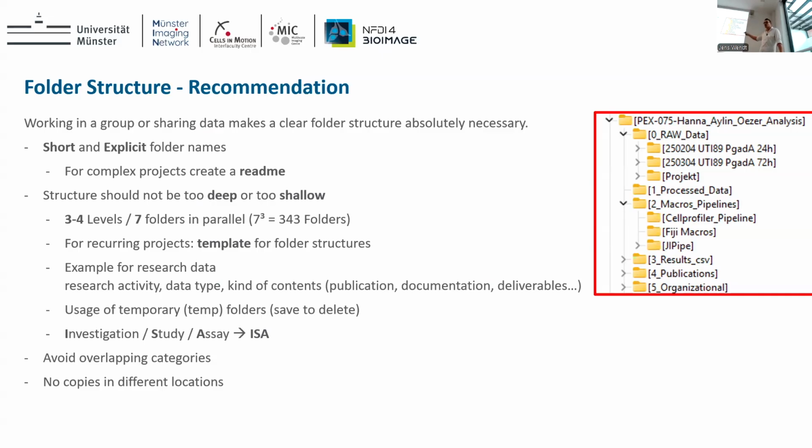We're also creating an eLab experiment entry for image analysis tasks. This is the same number as on our folders. And then we always create the same folder structures, so that if Sarah is on holiday, I can find the data from someone else, and I know where the macros are saved that they are using and working on.